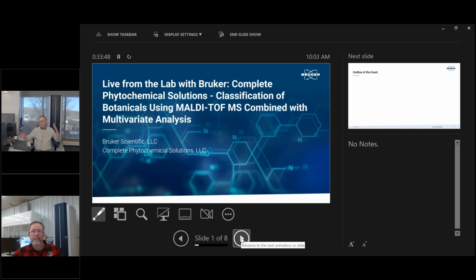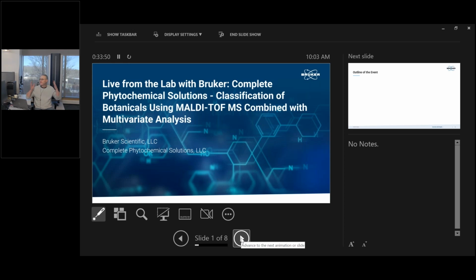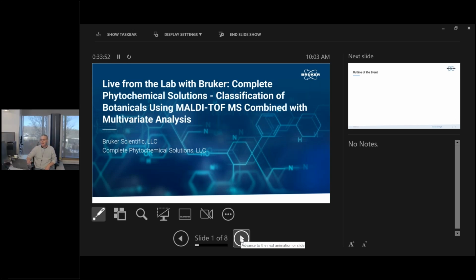This is live from the lab with Bruker. I'm here in the beautiful demo lab in Billerica, Mass. Today, we're going to be going over with Christian from Complete Phytochemical Solutions, the classification of botanicals using MALDI-TOF MS combined with multivariate analysis.